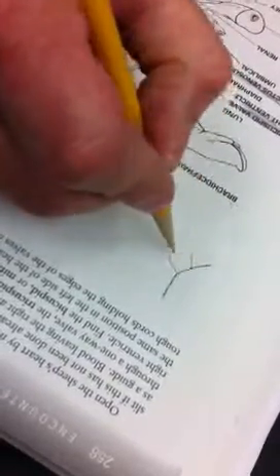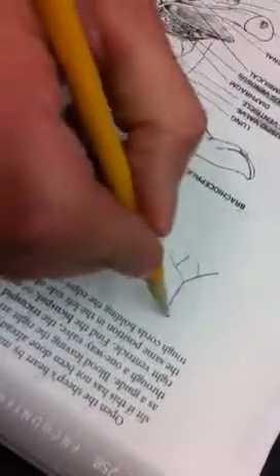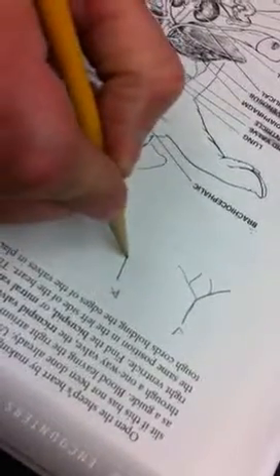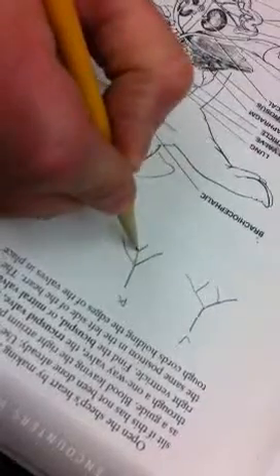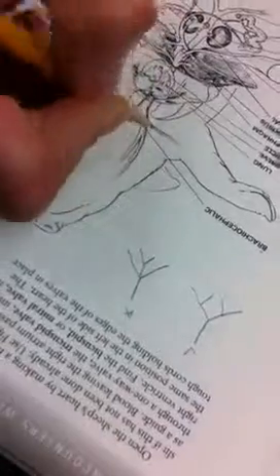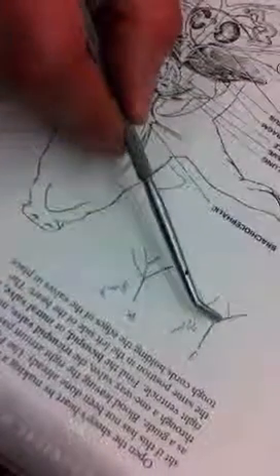Okay, so inferior vena cava, common iliacs, external iliac, internal iliac, external iliac. So those are the veins. With the arteries, aorta, external iliacs, internal iliacs. Oh. So same names but different branching pattern. Right. And these will be pink. And then those would be blue. Okay. And like I said, we can see this far, but then we lose the injection, and I don't see those in yours. Okay. These were all veins so far. Yes, all veins so far.